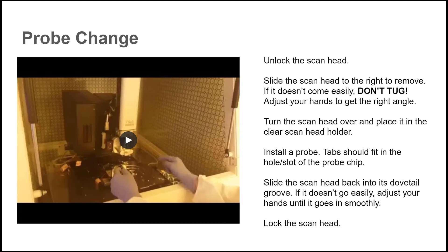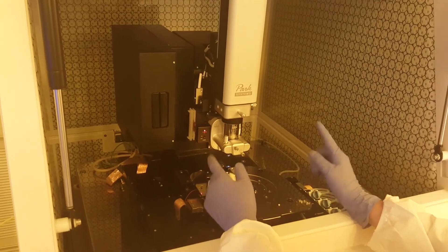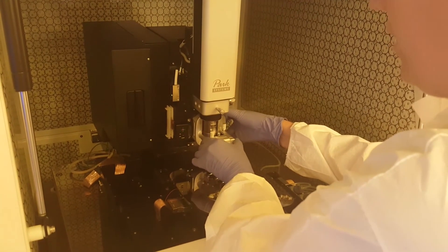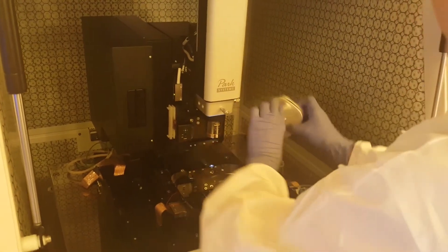Let's begin by exchanging a probe — we're going to watch a video of this happening at the tool. You'll see the following steps: unlock the scan head, slide the scan head to the right, place the scan head in its holder, install a probe, slide the scan head back into its dovetail groove, and lock the scan head. To put a new tip on the tool, first unlock the scan head by pushing the tabs — elephant ears — in, then take the scan head and slide it to the right. It should come easily; if not, change the angle of your hands and don't force it.